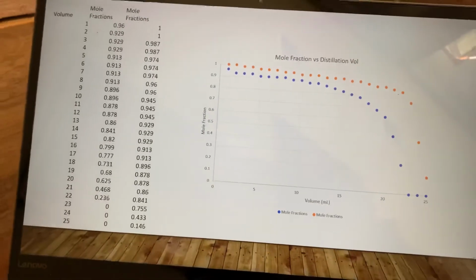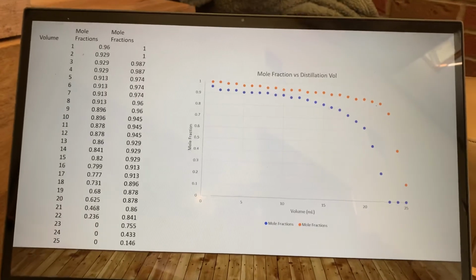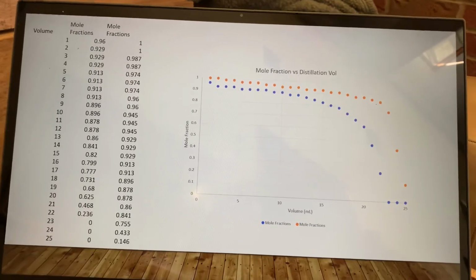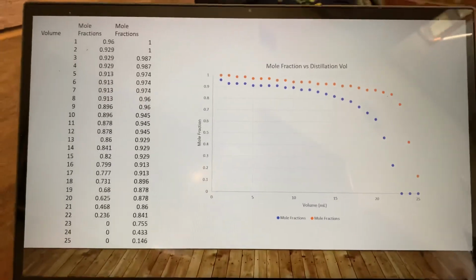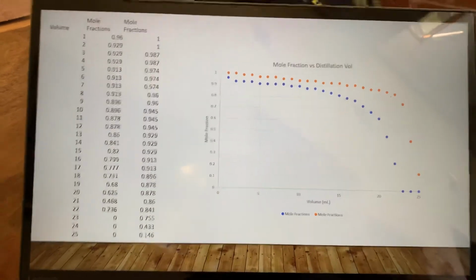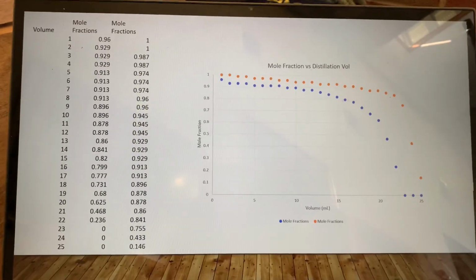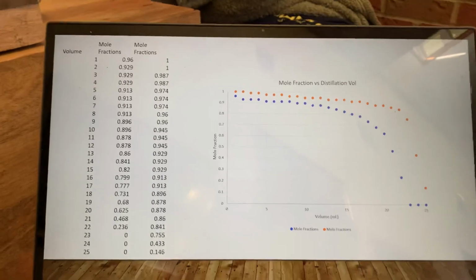And then when you want to use less than 10%, you're not able to use it because there's really nothing less than 10% unless you're using simple, and it's just zero. Like there's nothing that's less than 10% that's not zero. So you're wanting to use fractional because it's easier, it's more important, and with the heat, it's more likely to be helpful.